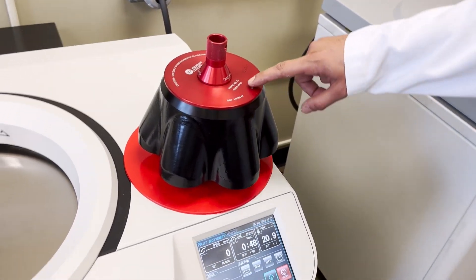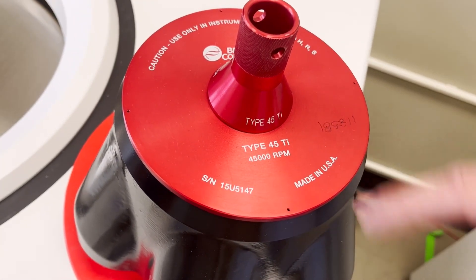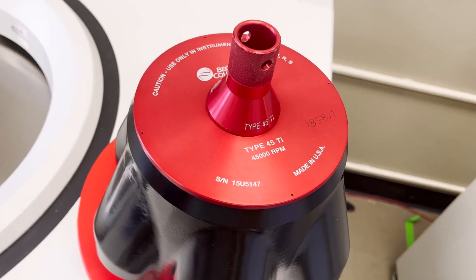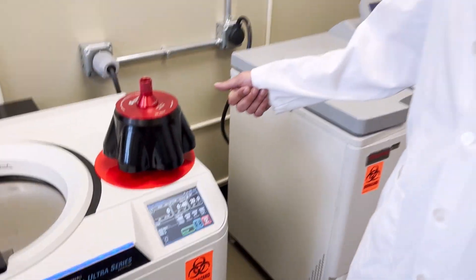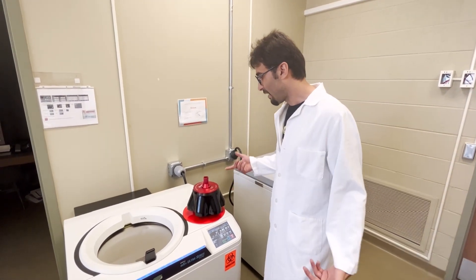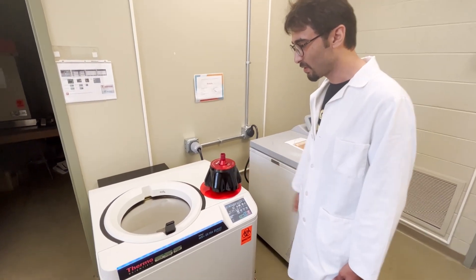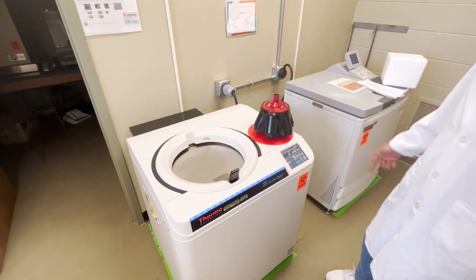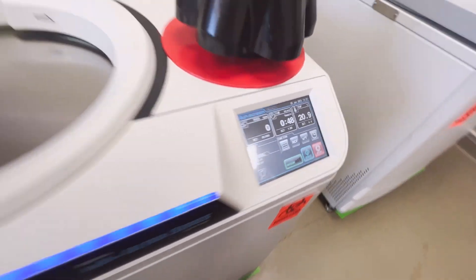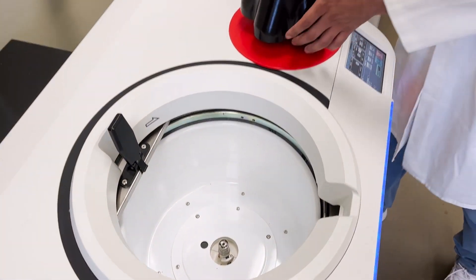You can see on any rotor in this lab at least two numbers: one is the rotor type number and the other is the RPM. Depending on the RPM you want, you choose your rotor. So if our sample needs a maximum of 45,000 RPM, we take this rotor.